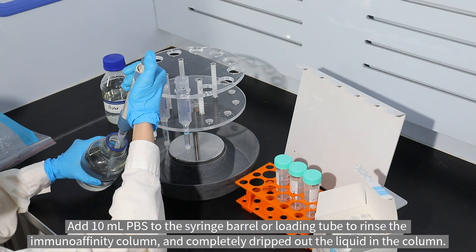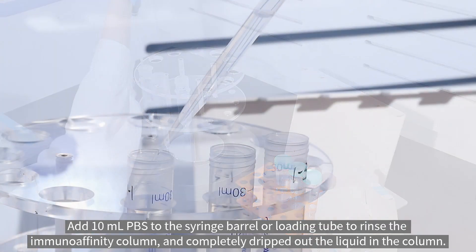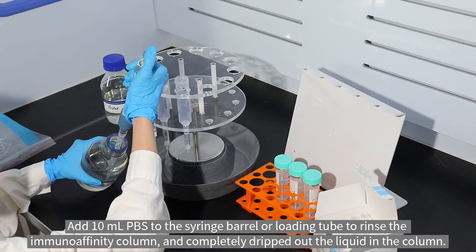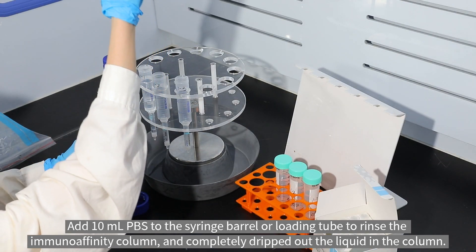Add 10 milliliter PBS to the syringe barrel or loading tube to rinse the immunoaffinity column and completely drip out the liquid in the column.